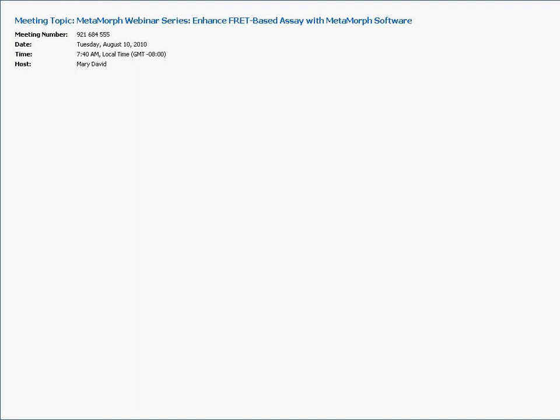Yeah, one more. From Alfredo: is FRET occurring all the time or just when we excite the donor? Again, you can potentially get some FRET through, but the only true way FRET is happening is if you excite the donor, because that's the true calculation. The potential problem that we see is that both the emission crosstalk and the excitation crosstalk can happen, and that's why they need to be corrected.